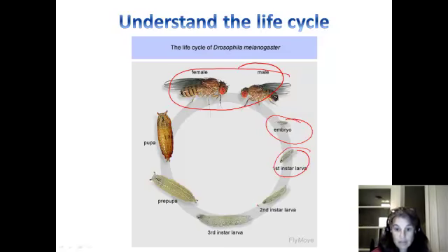And in the vials that we have in class, and you'll see them shortly, there is a blue gooey substance in the bottom of the culture vials, the containers that the flies are in, and this blue stuff is simply their food, and these little caterpillar-type larvae are just burrowing in that food, and they slowly grow into different stages, and finally the last stage of this caterpillar type gives way to something resembling a pupa, or a cocoon stage, if you will.